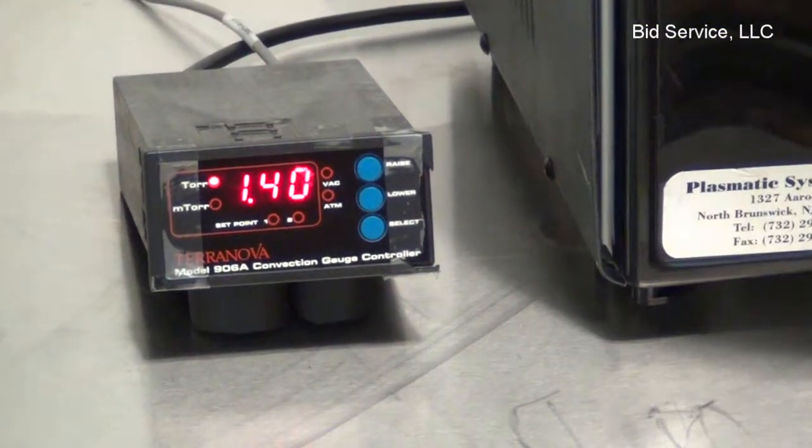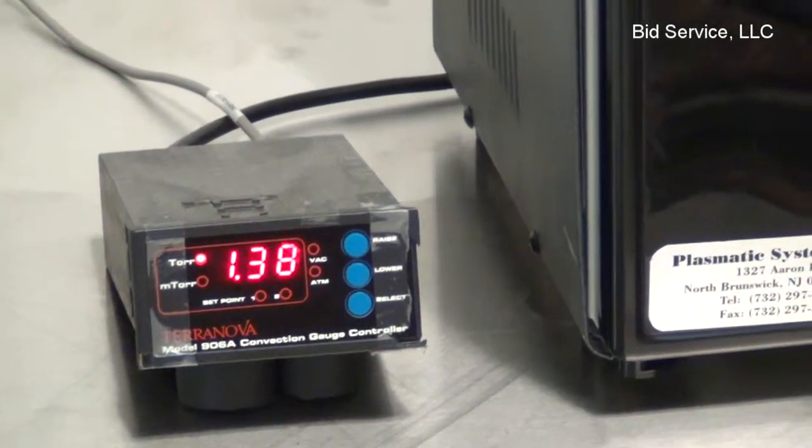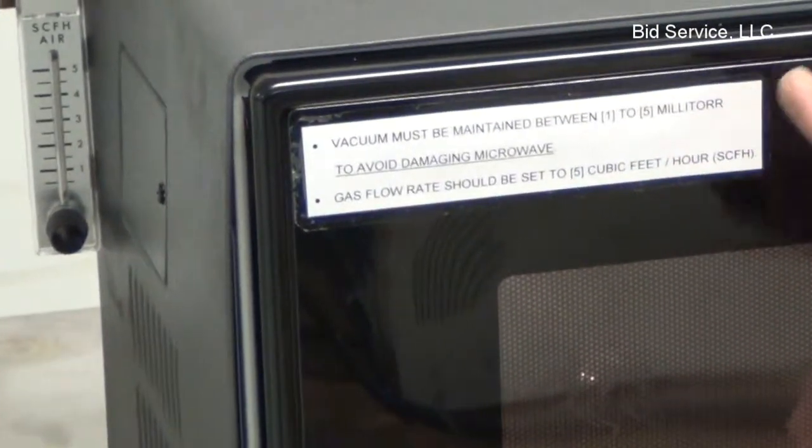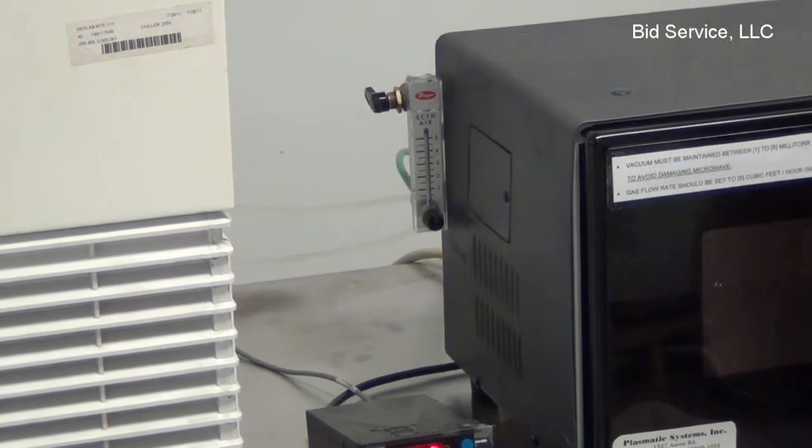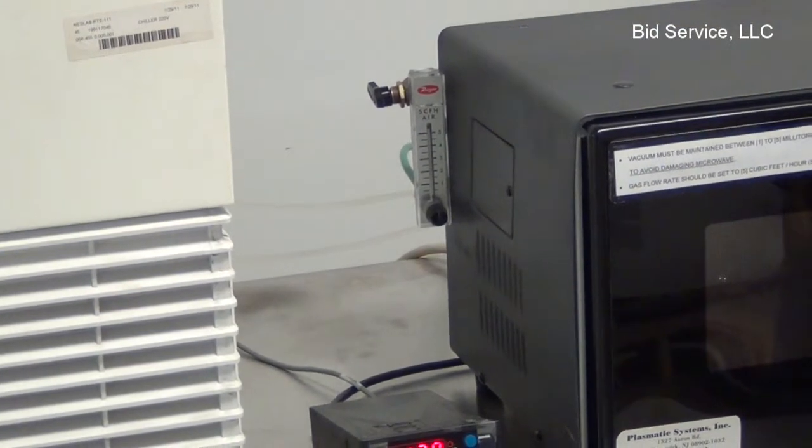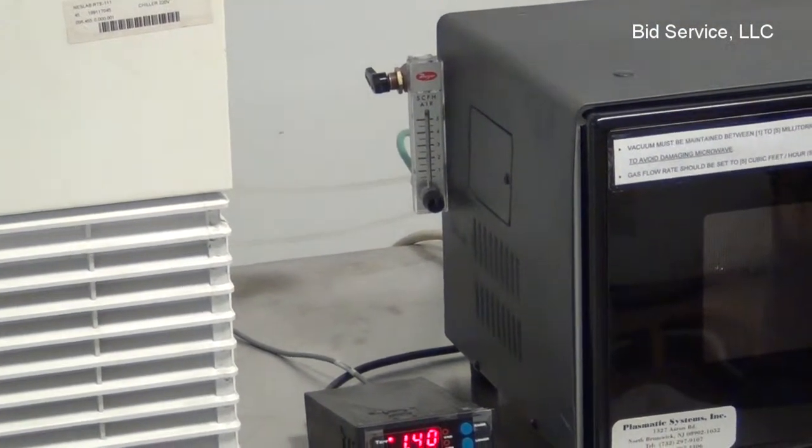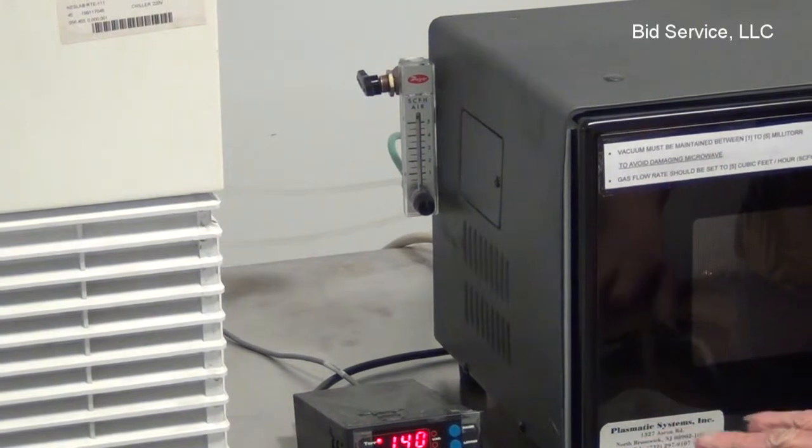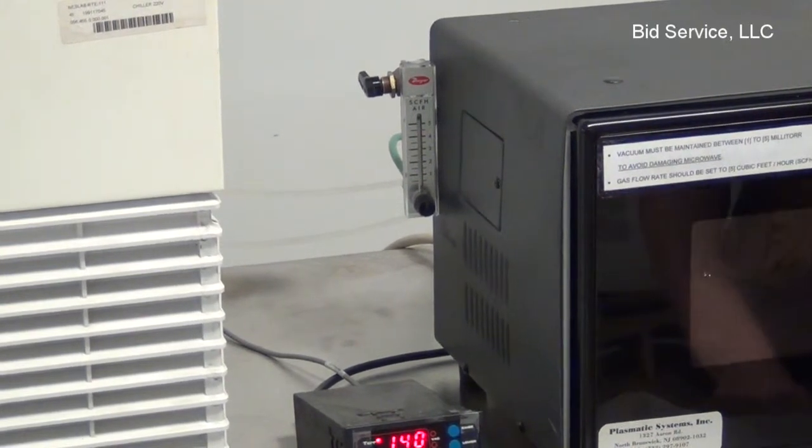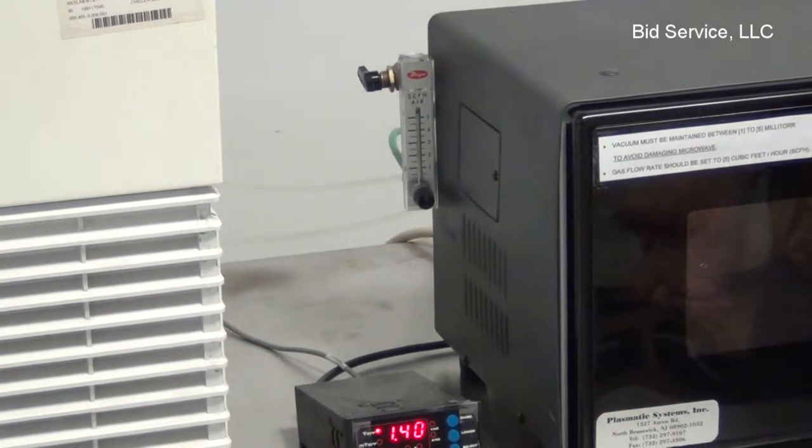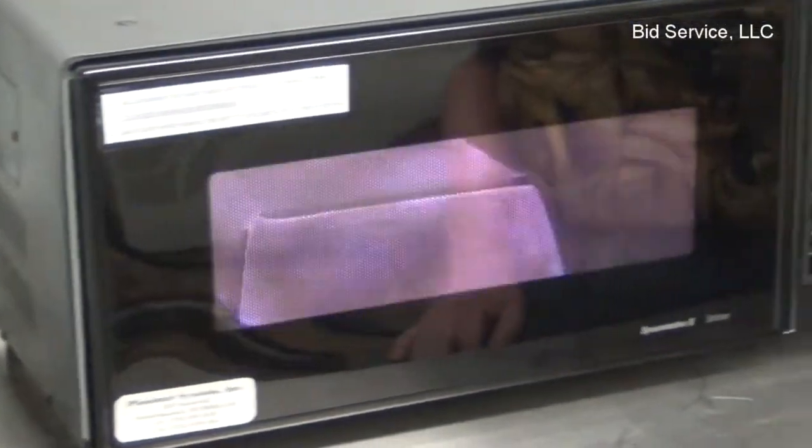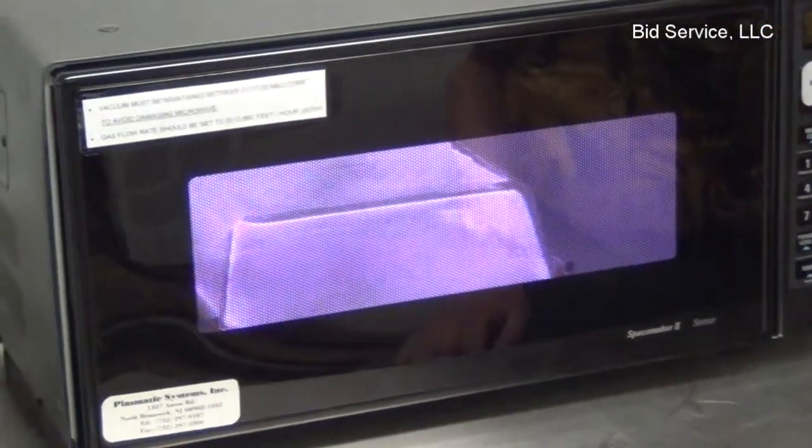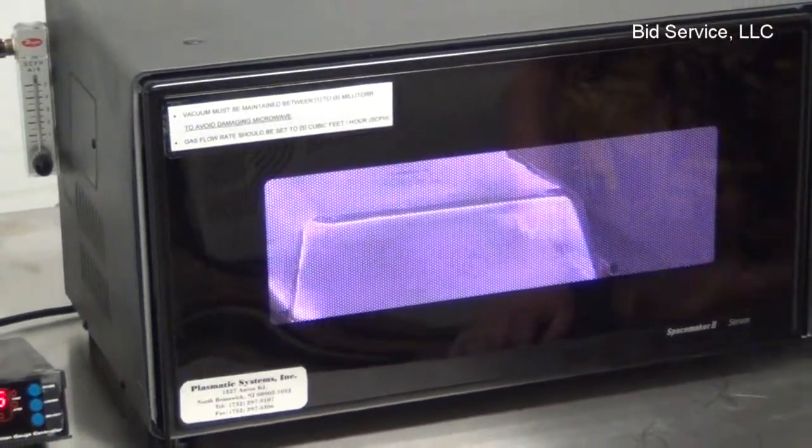Also, gas flow rate should be set at 5 cubic feet an hour. This is also important and can be regulated by this flow meter right here. Now, once your cooling water is sufficient, you have sufficient vacuum, and you have sufficient flow of gas, it's then as simple as starting it like any microwave at home, and the plasma will ignite.